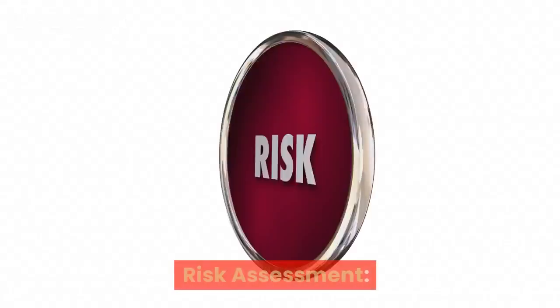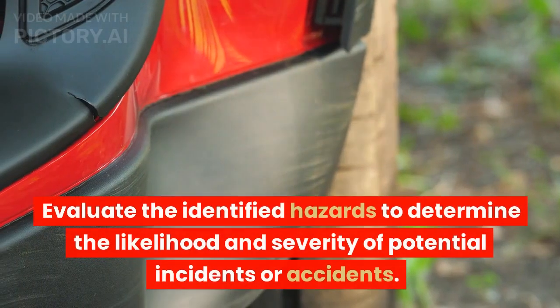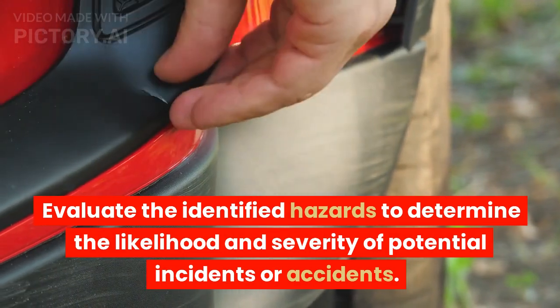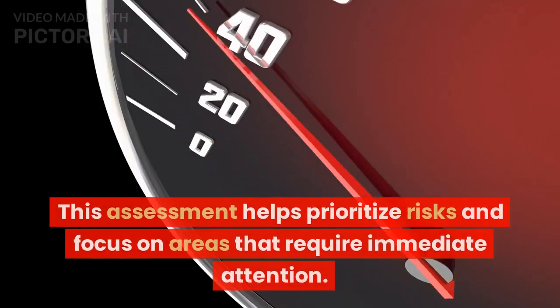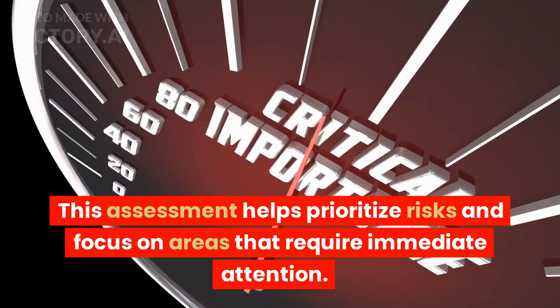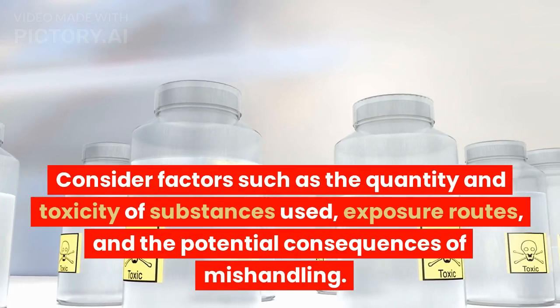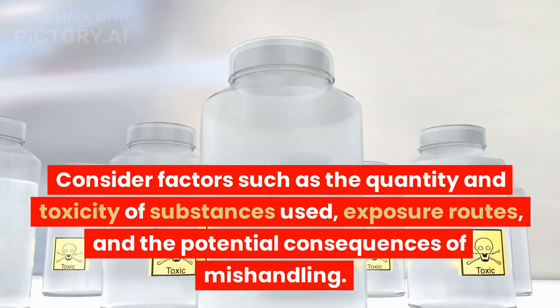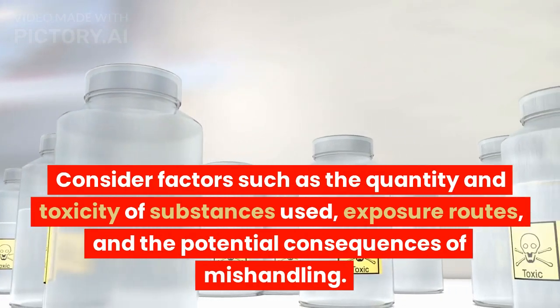2. Risk assessment. Evaluate the identified hazards to determine the likelihood and severity of potential incidents or accidents. This assessment helps prioritize risks and focus on areas that require immediate attention. Consider factors such as the quantity and toxicity of substances used, exposure routes, and the potential consequences of mishandling.